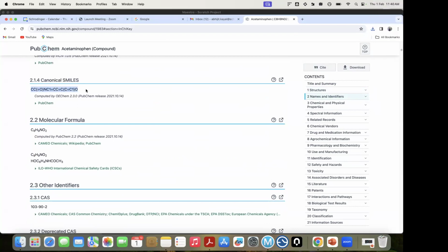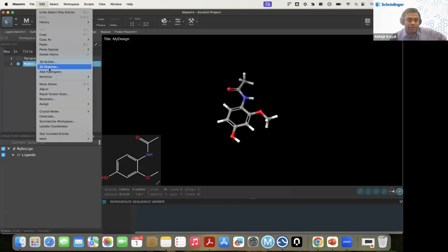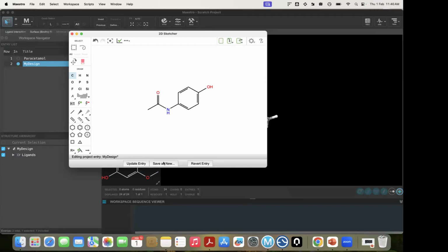Okay, so I'll just copy this canonical SMILES, and I'll go back to my Maestro, and go to Edit, then the sketcher. I'll just delete. This is a delete option here, and I'll just paste. So if you paste this canonical SMILES, then the structure will come here, and you can again save it.